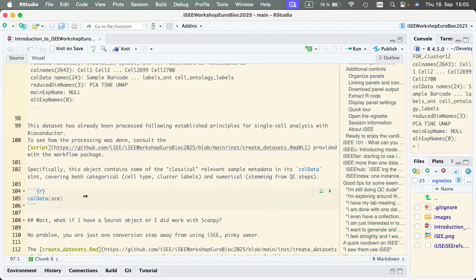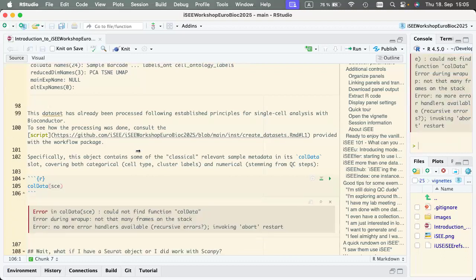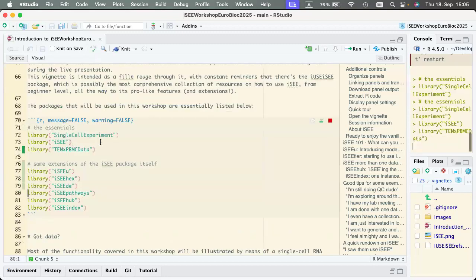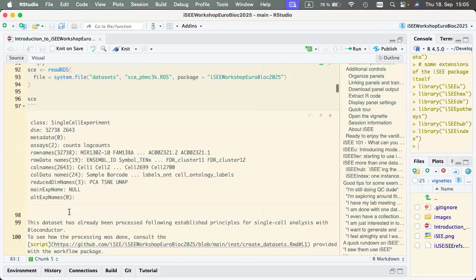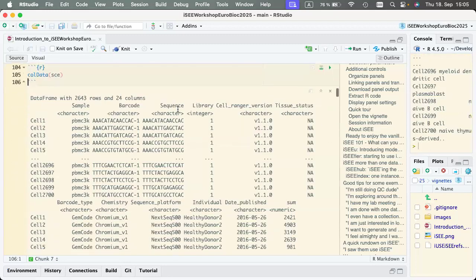What do we have in here? It's a couple of colData. Oh, that is odd as an error. SingleCellExperiment isn't? Okay, interesting. Then let me just run this as well for you. Yo, good catch. Okay, thank you.